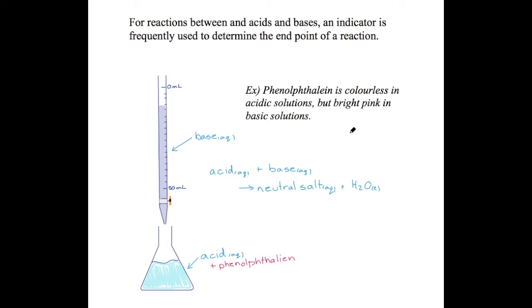For example, let's take the case of phenolphthalein. Phenolphthalein is a very common indicator. It's a common indicator, but as we can see here, it is also pretty hard to spell. So really quickly, how about I cover up the mistakes I've made? It happens. Phenolphthalein, tough to say, very valuable indicator.